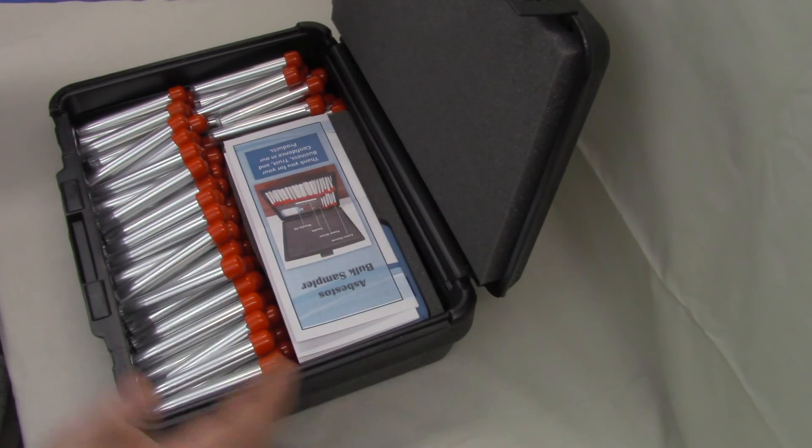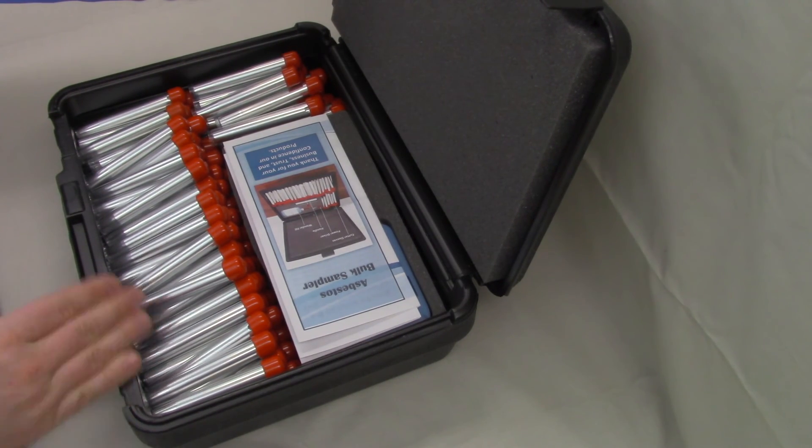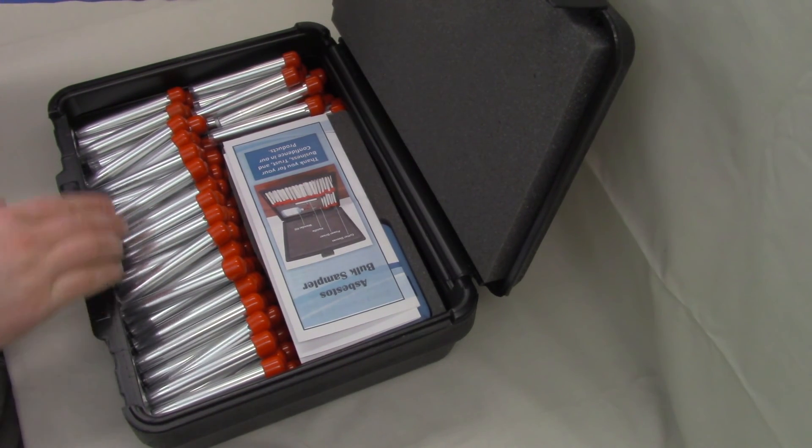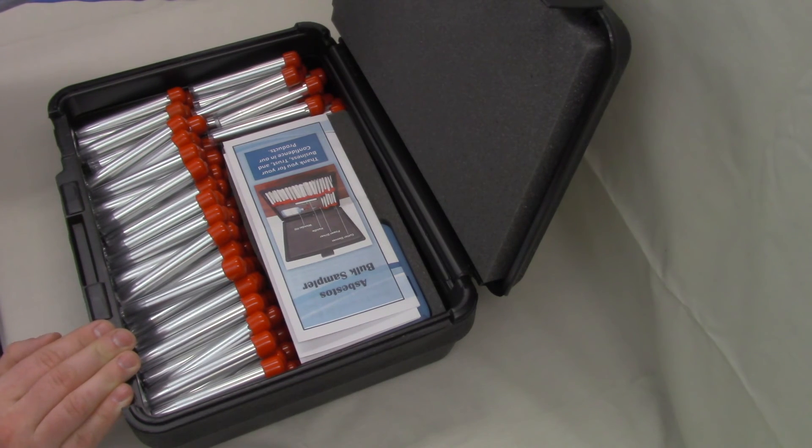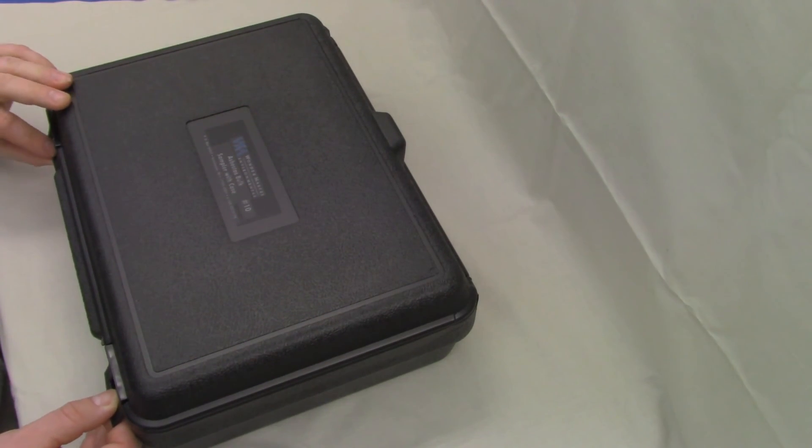We do offer the cutter sleeves in replacement packs of a hundred, five hundred or a thousand. Obviously you can't fit five hundred or a thousand in here, but you do fit a hundred in here nicely. So that allows you to refill it. And then if you're doing a lot on a bulk project or something, there you go, you got the bigger sizes and there's a small cost savings for ordering them in bulk as well. We look forward to serving you with this and other products. Thank you.